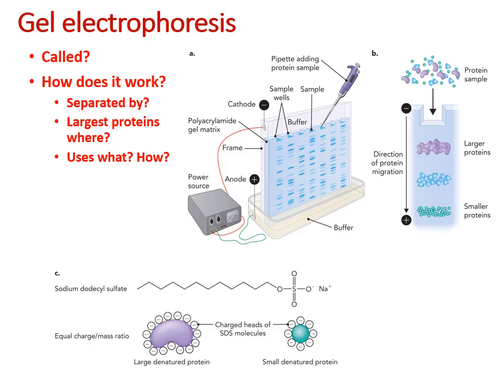The next method in protein biochemistry that I want to go over is gel electrophoresis. Gel electrophoresis is an important technique not just for proteins, but also for things like DNA. So you've probably worked with it in some of your other classes and laboratories, including intro bio labs, and if you took genetics already.